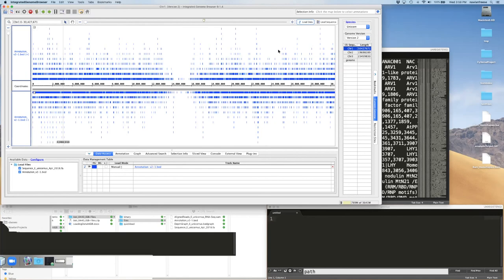BED files tend to be pretty small — there's only so many genes — so we usually load the whole thing at once. This now gives us the normal view to work with in IGB, and I hope that explains what's happening when you click on a genome — IGB is loading two separate files: the reference sequence and the annotation.